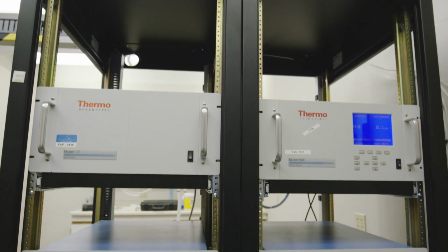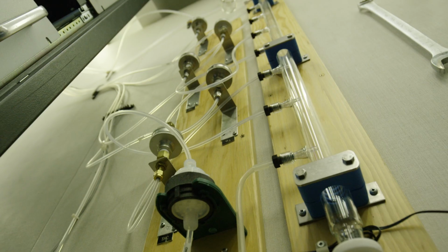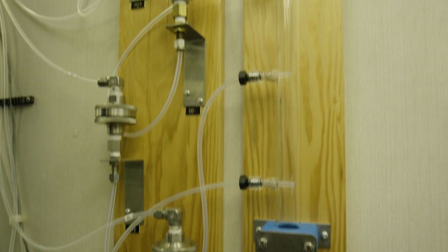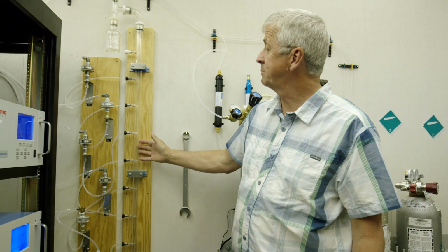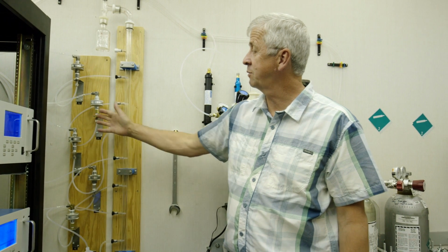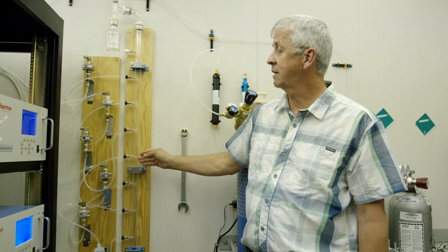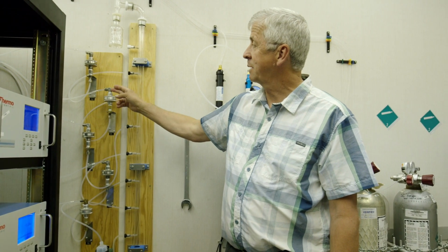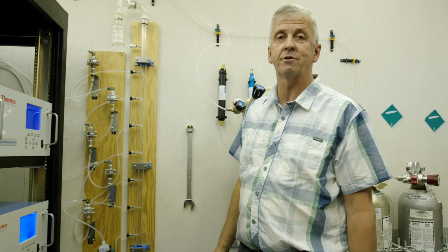Together our stations measure a variety of 19 substances and a number of weather conditions like temperature and wind speed. The data we collect is used to determine the quality of local air both in real time and forecasts for the next day. So the outside air comes in through this glass tube, and then through these smaller tubes goes to the electronic equipment that measures what's in the air. For example, this one is for ozone, this one is for carbon monoxide, and one source of carbon monoxide is exhaust fumes from cars and trucks.